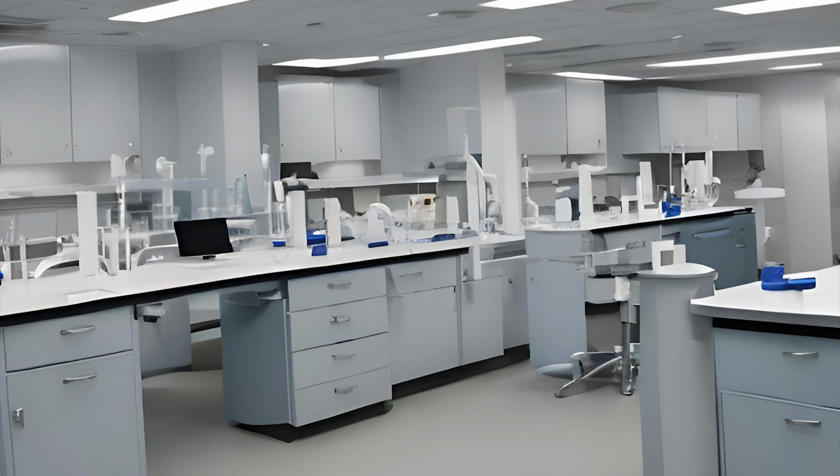Central processing is a screening and prioritizing area where specimens are received by the laboratory team and prepared to be tested by another section of the laboratory. A centrifuge is one of the workhorses of the lab. It is the instrument that's going to spin blood tubes at a high number of revolutions per minute to create centrifugal force, which will cause the blood tubes to rapidly separate out into their liquid components and their formed elements.